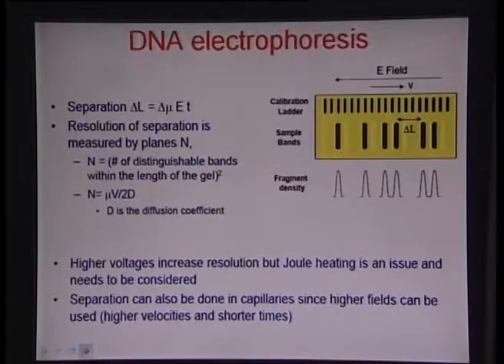Capillary electrophoresis, on the other hand, is something which can also be miniaturized very well into small microchip platforms. In a nutshell, some facts and figures about DNA electrophoresis are illustrated in this particular slide here.